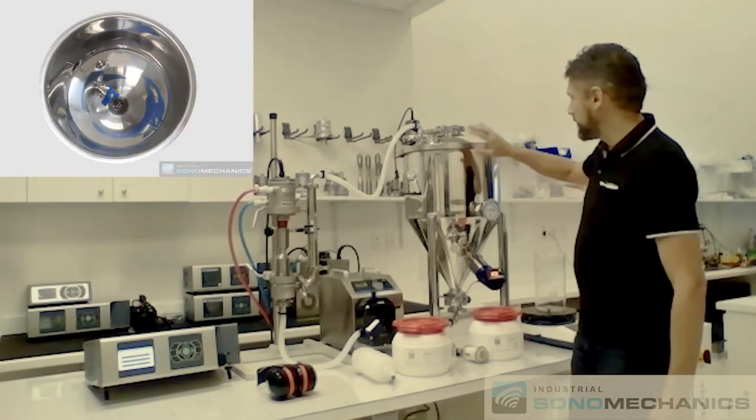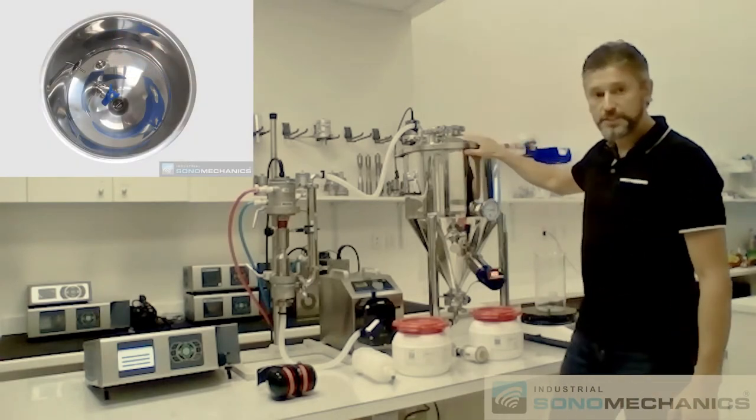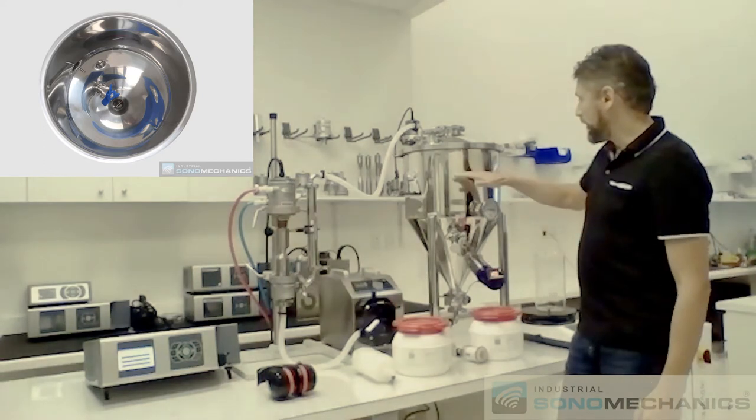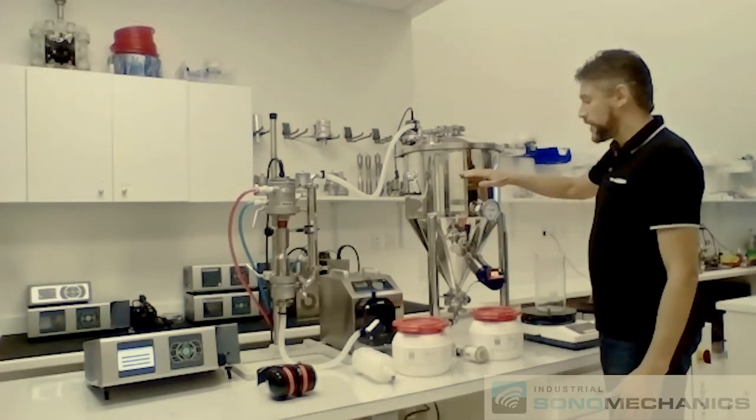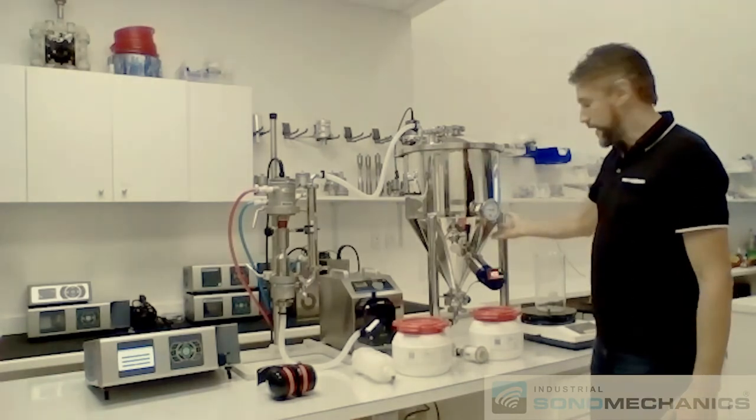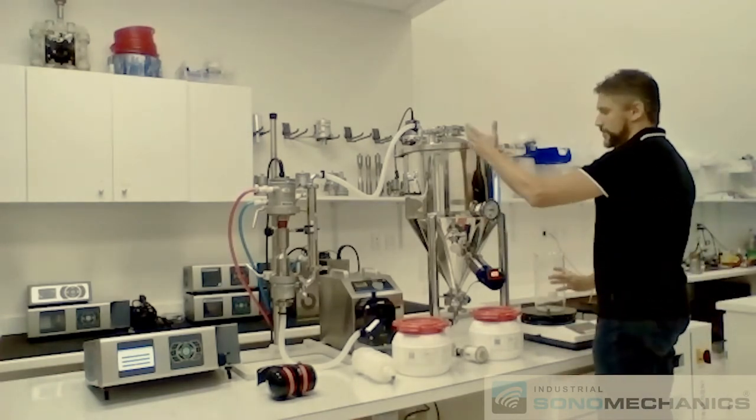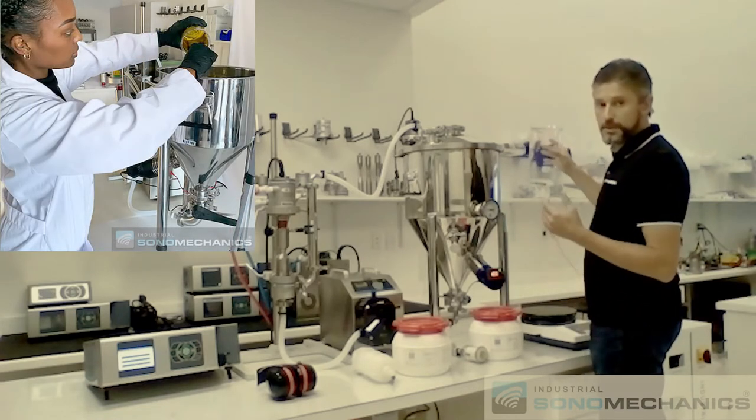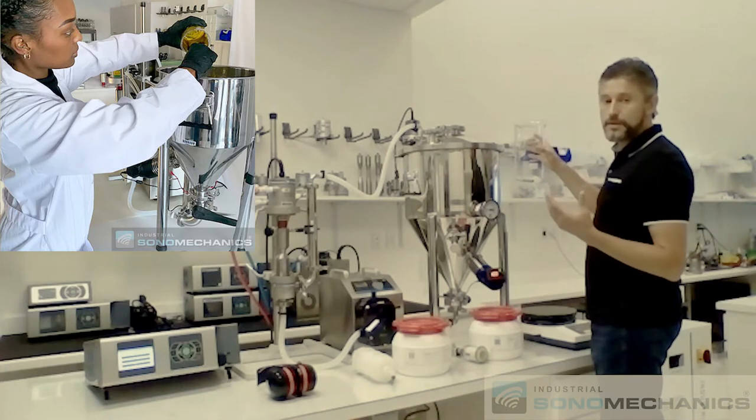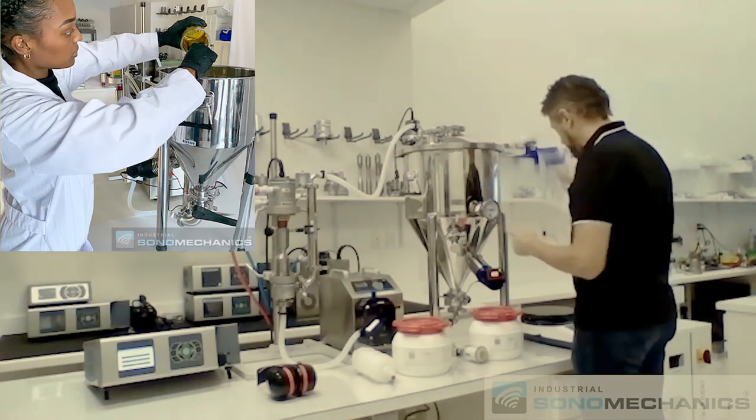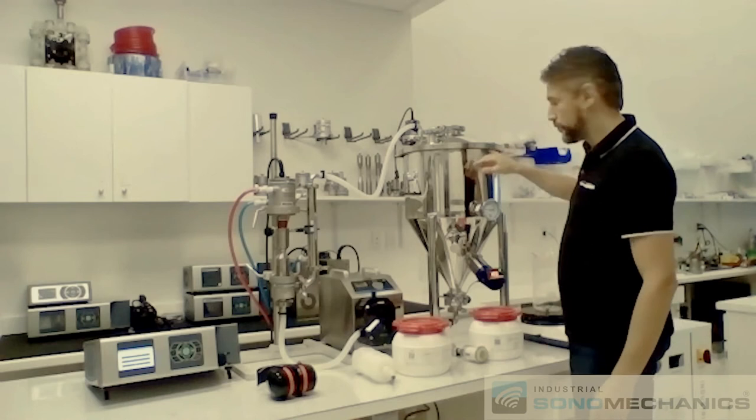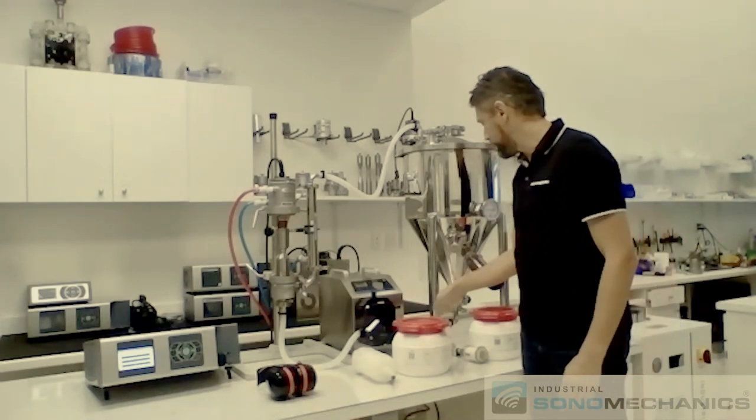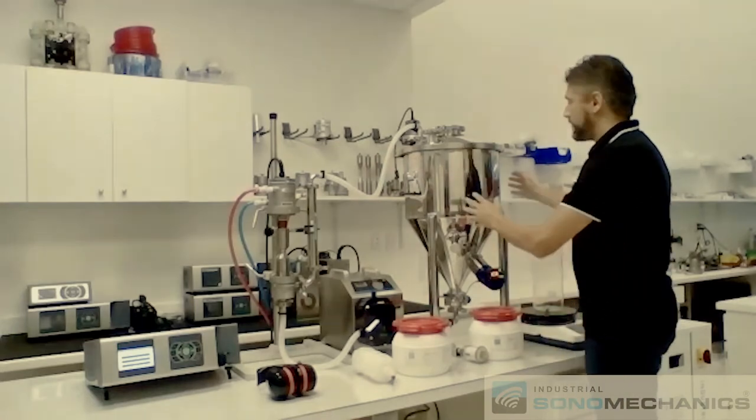Separately from that, in this storage mixing tank equipped with a magnetically driven mixer, you will have the appropriate amount of water. Gently mixing in this tank, you will open up this lid, put your oil phase, which is nanostabilizer LT and cannabis extract into the water phase as it's being mixed with a vortex. So at this point, you don't have anything flowing out of it or back into it. Everything is just sitting in this tank.